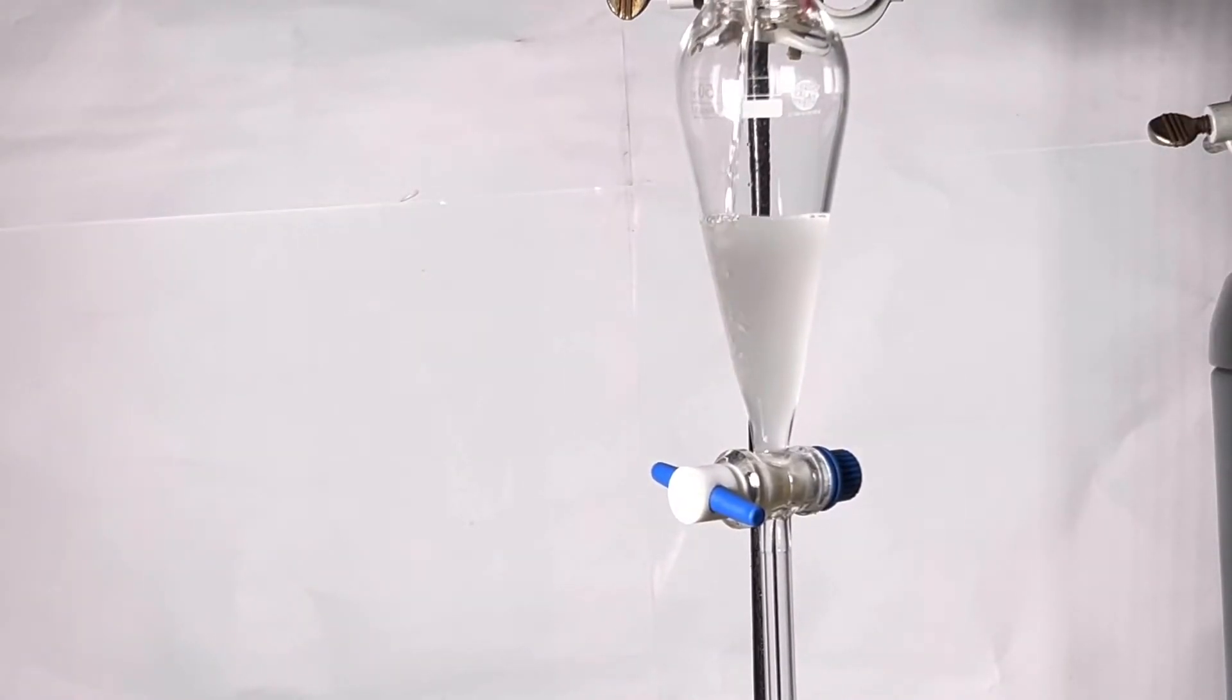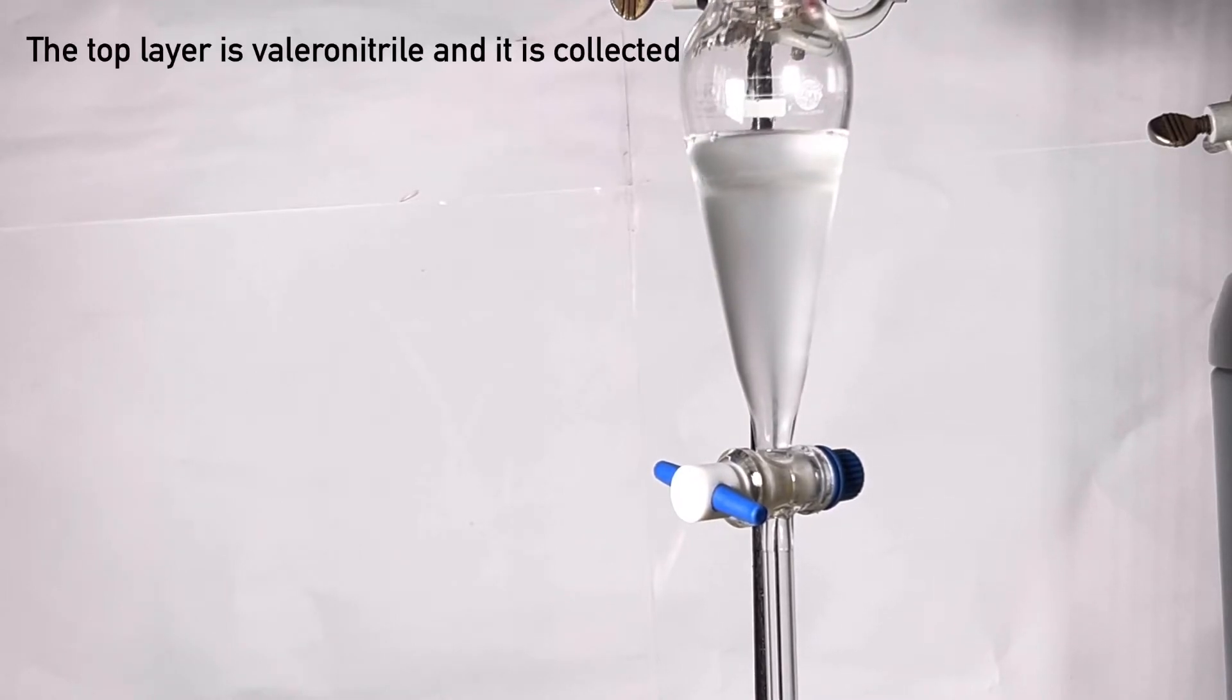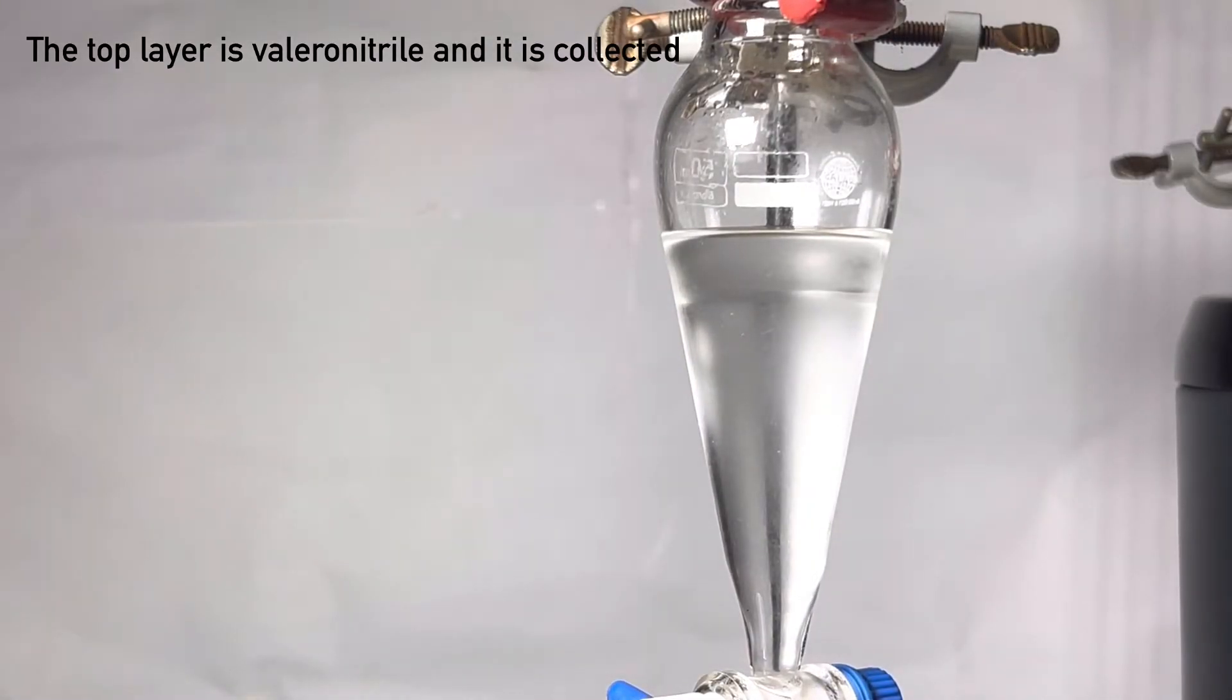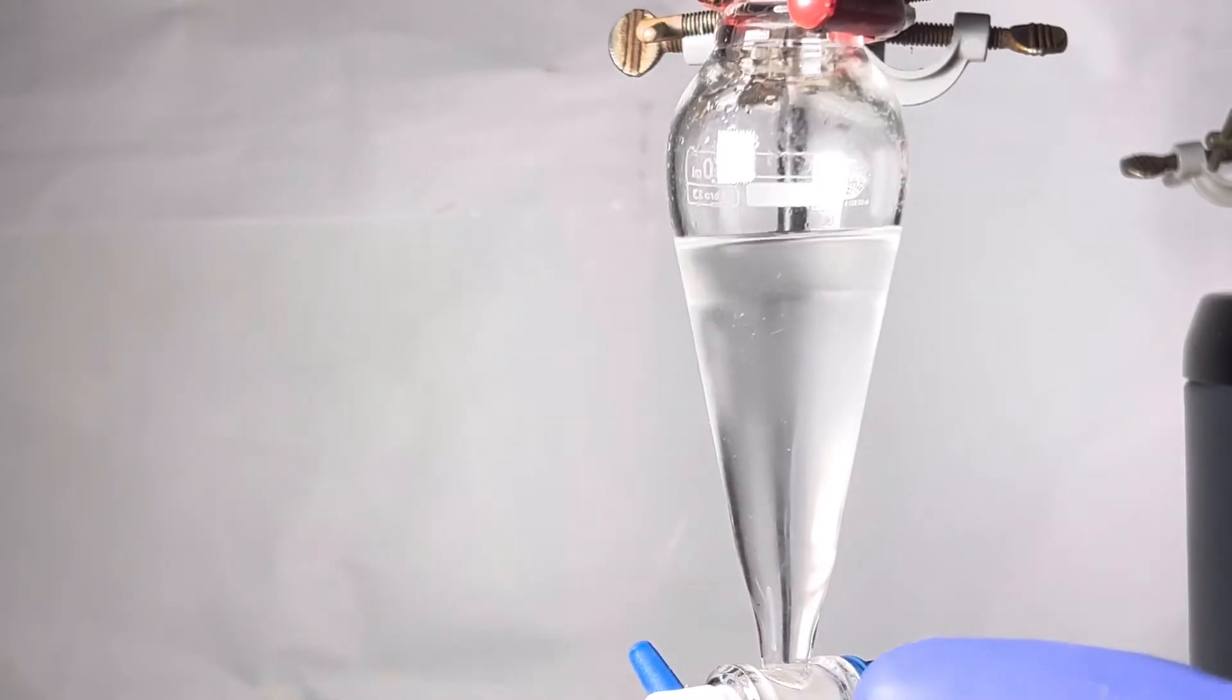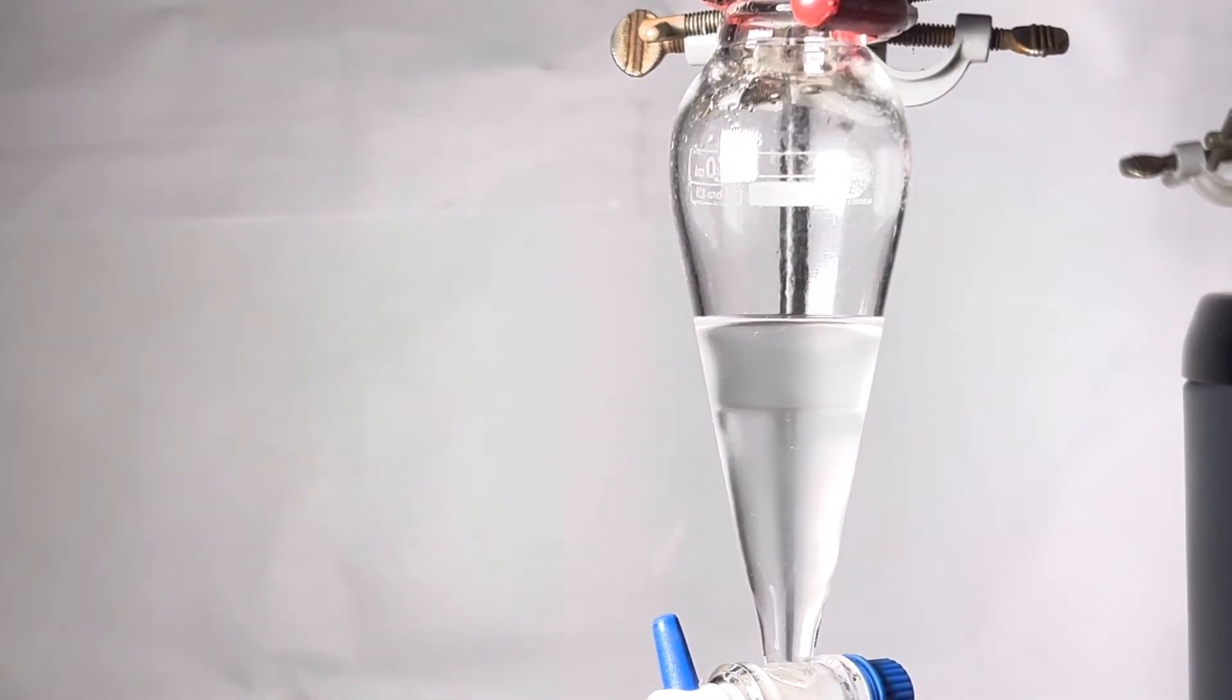The contents of the receiving flask was transferred to a small separatory funnel. In the separatory funnel we clearly notice the top layer and that is the valeronitrile. It was separated from the aqueous layer and was collected in a small round bottom flask.